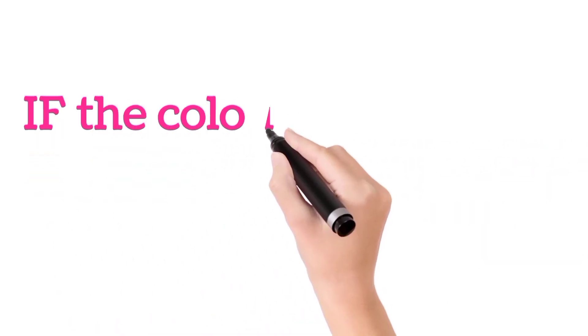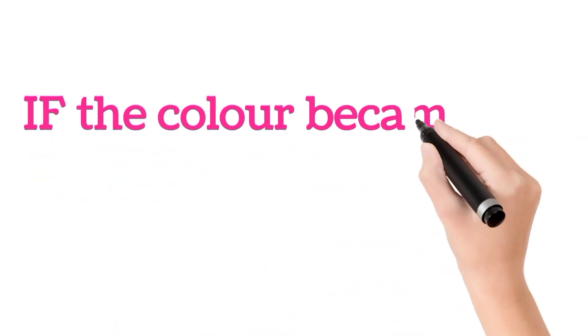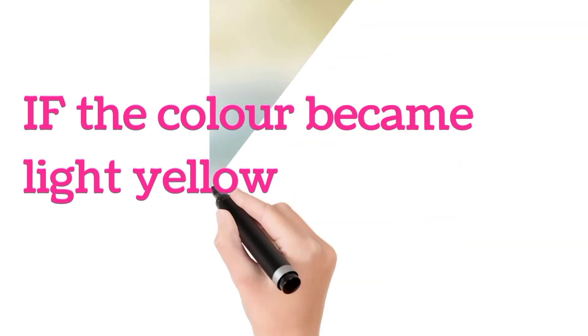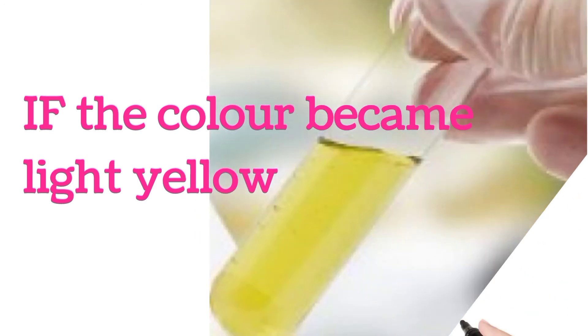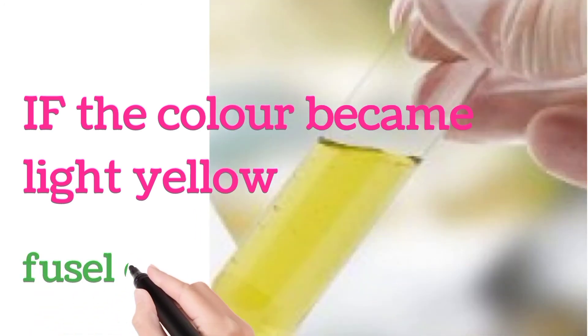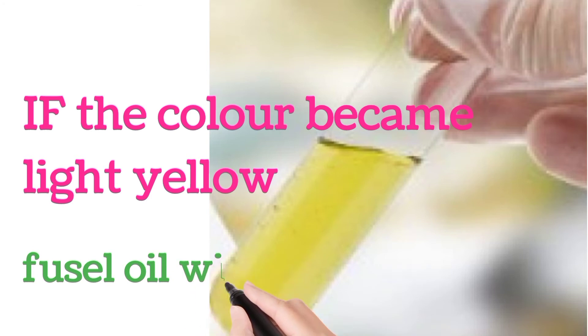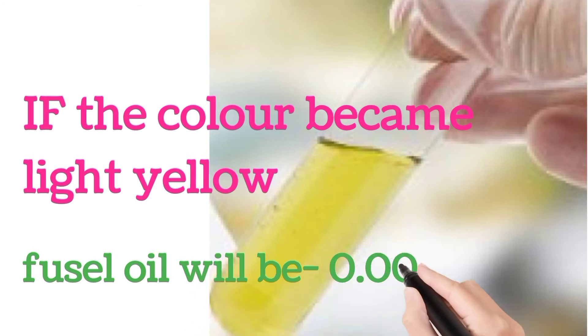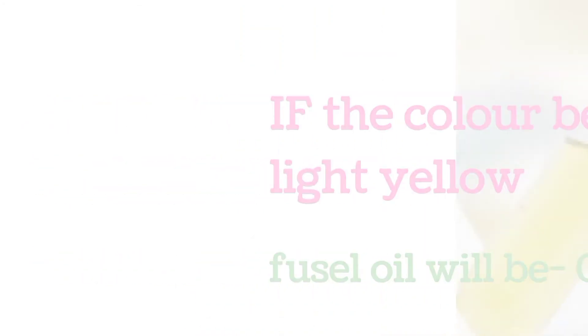If the color became light yellow, then the Fusel Oil will be 0.005%.